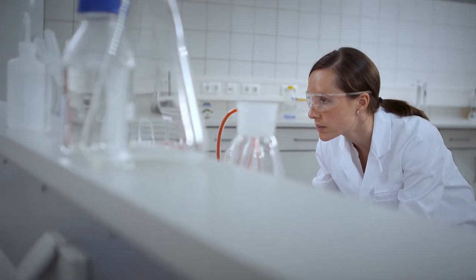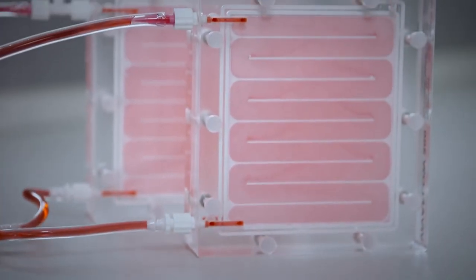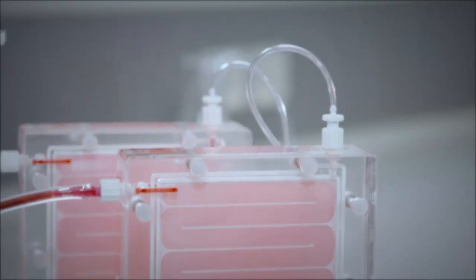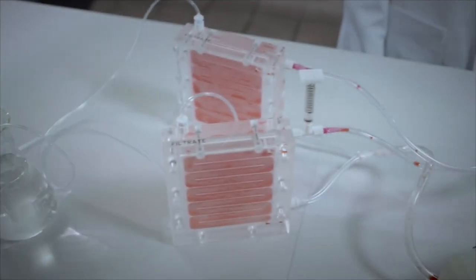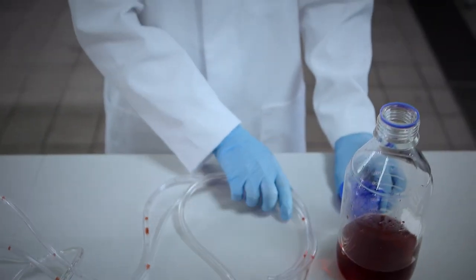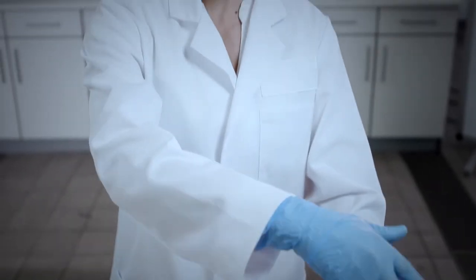Once the desired concentration volume has been reached, stop the run manually. Air must then be pumped through the system to recover the entire sample from the Vivaflow 200 unit and from the tubing. It takes less than 30 minutes for the sample to be concentrated 10 to 20 fold. Now, the concentrated sample is ready for the next step in your process.